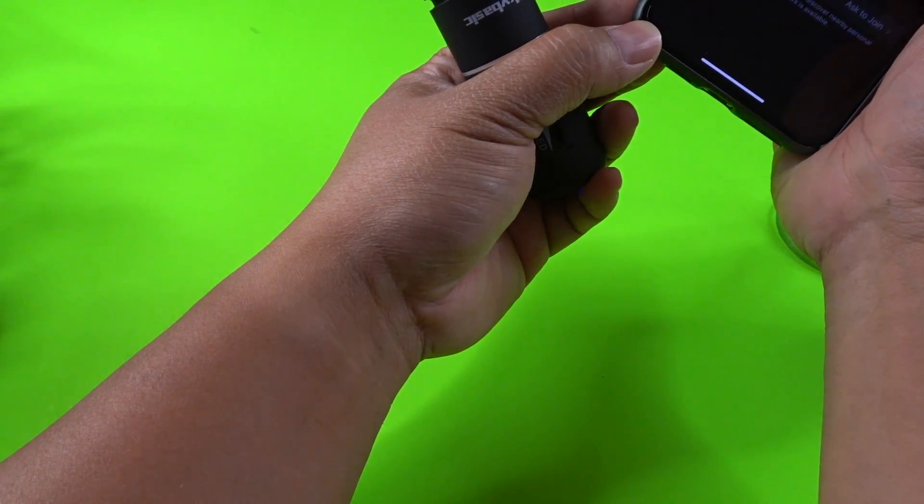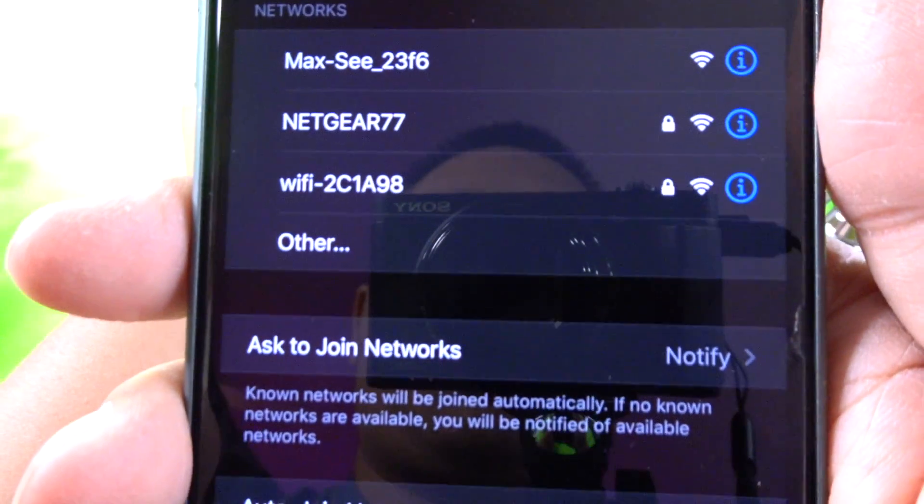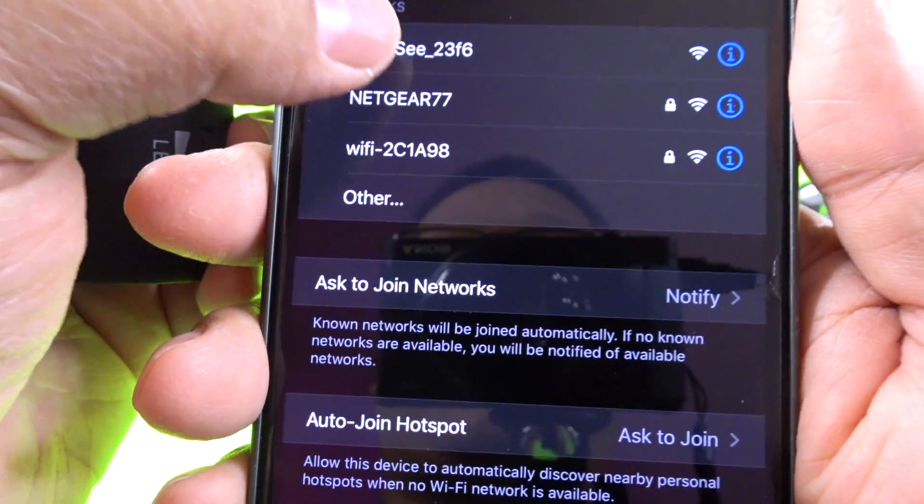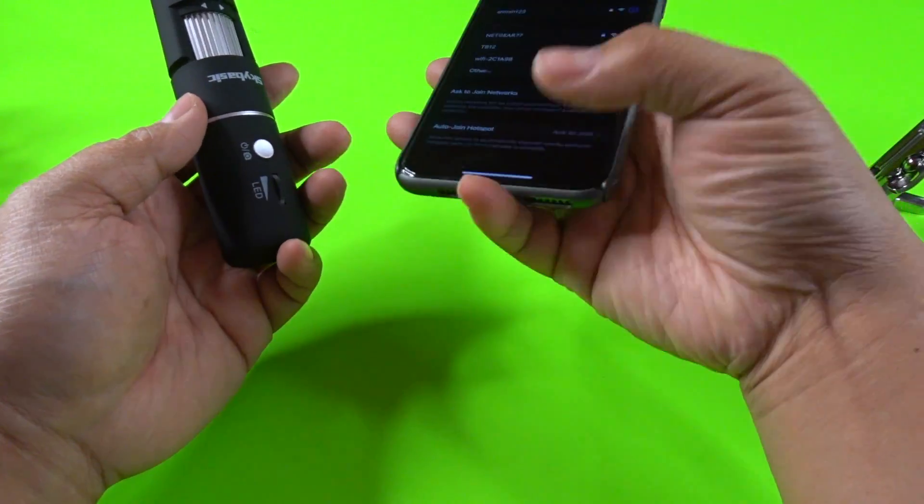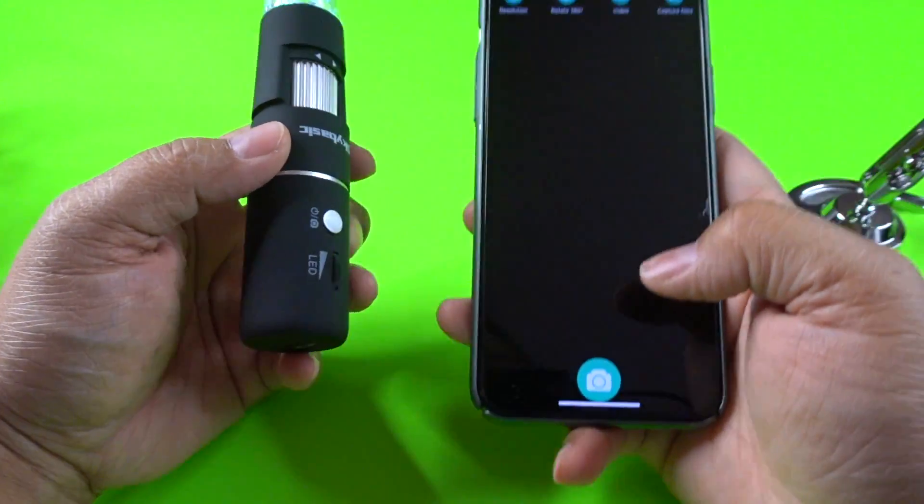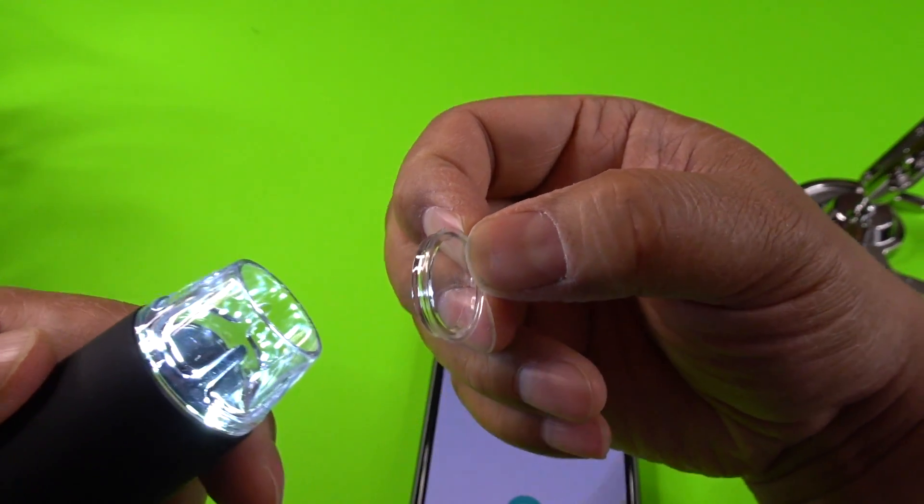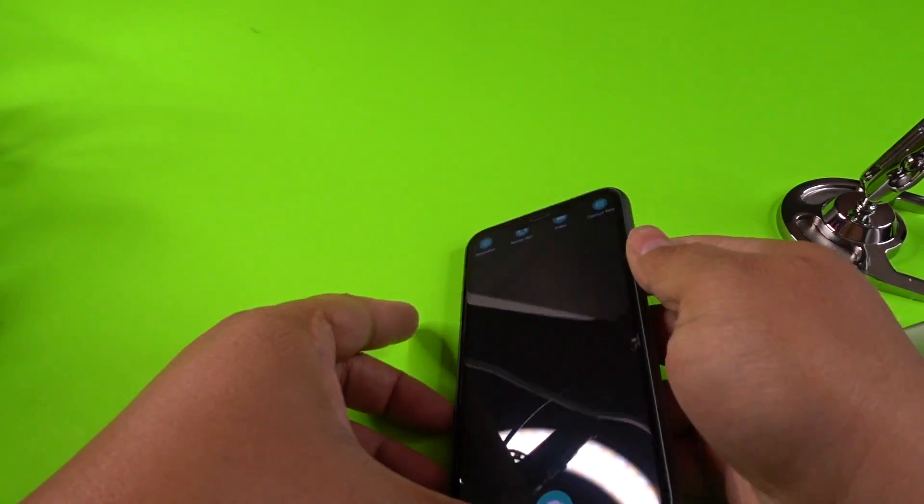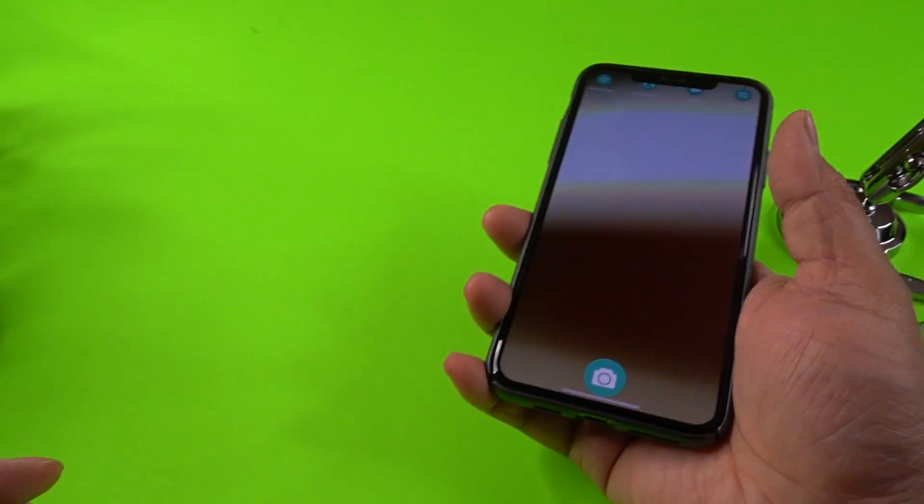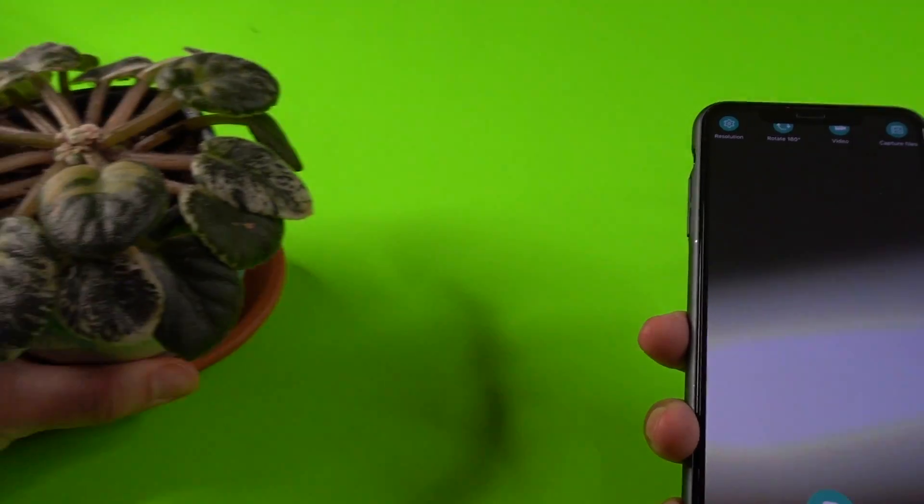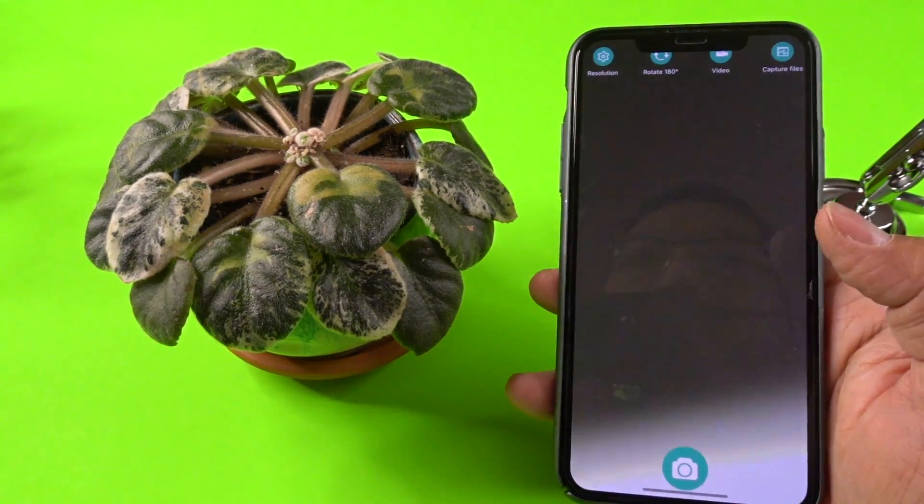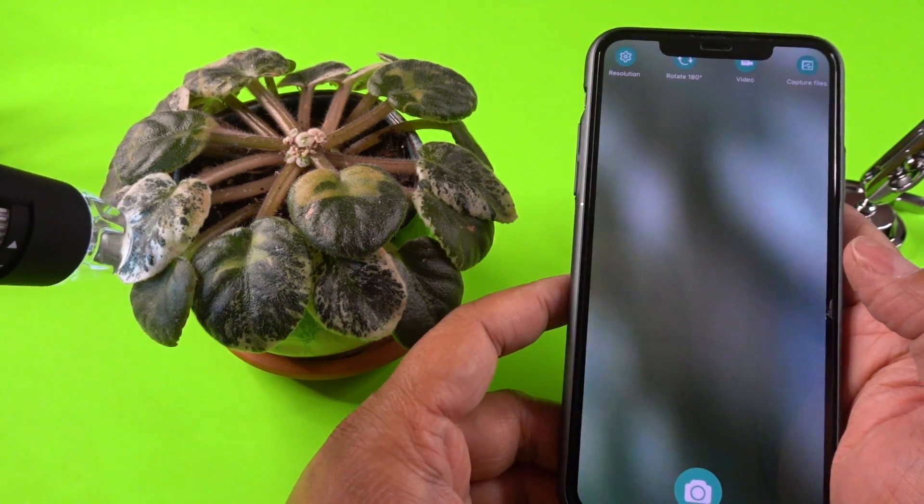And under wi-fi networks I'm going to see Max C 2, 3, 4, F6. I'm going to hit that. And I'm connected to it. I'm going to go back to the app. So let me take the lid off. So there is a lid right here. Alright let me take the protective lens cover off. And now let me bring in a plant so we can see the leaves. So let's go ahead and do that.